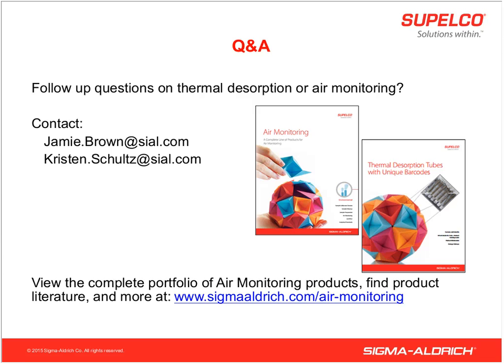Okay. Richard has a two-part question, so I'll give you the first part. What is the limit on molecular weight or boiling point for using thermal desorption? Well, that can range with the different instrument manufacturers, but in terms of the adsorbent, we're looking at around C40.